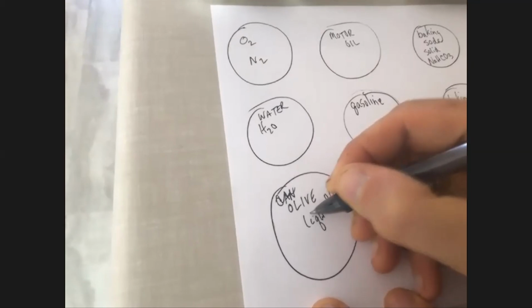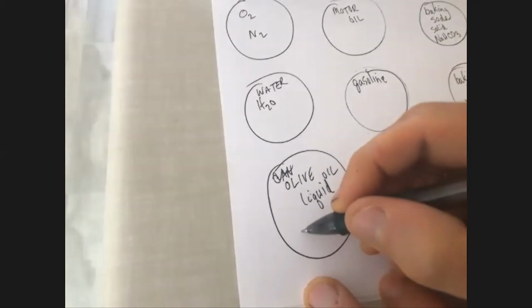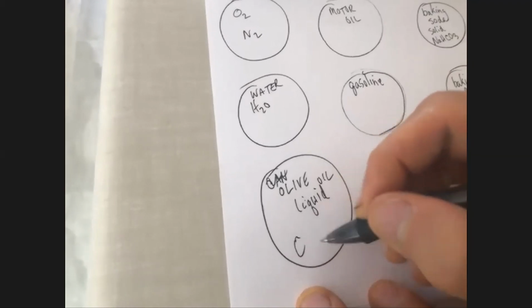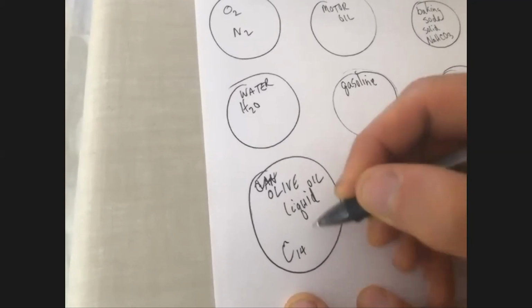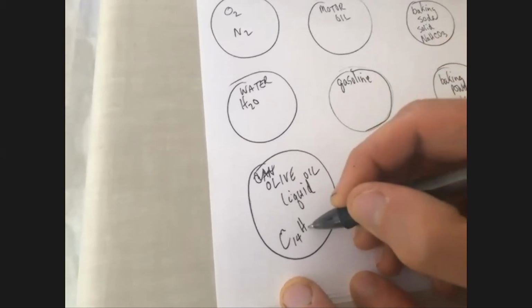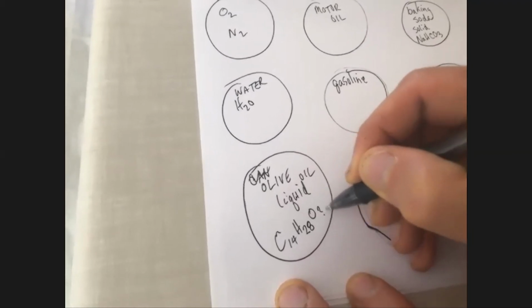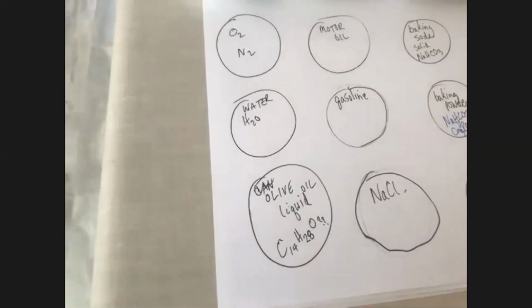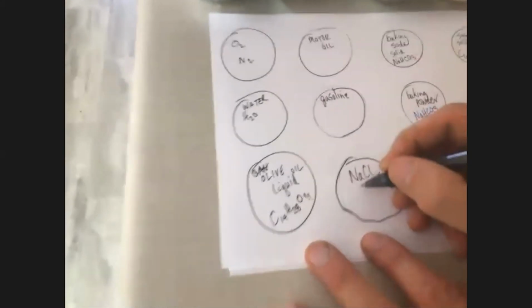Yep. And probably like carbon with maybe 14 or so carbons, maybe 28 or so hydrogens, and there's probably a bunch of oxygen in there, but I have no idea how many. Yeah, that looks fine. And the table salt is also a solid. All right, good point, thank you.